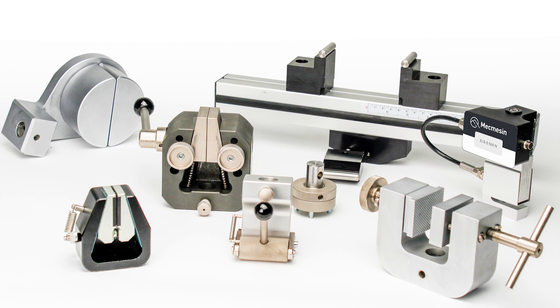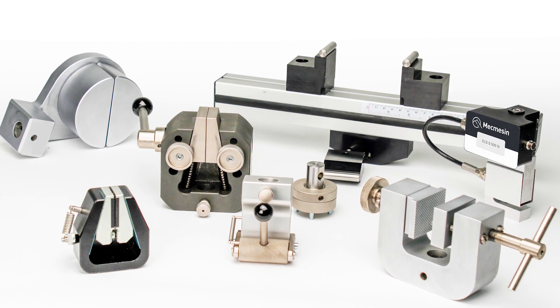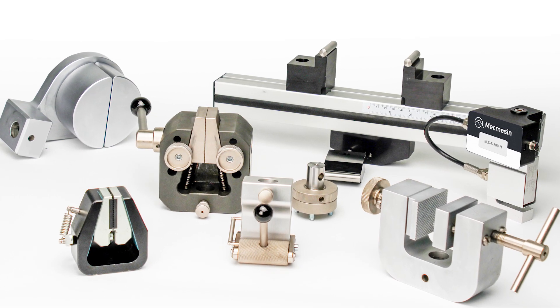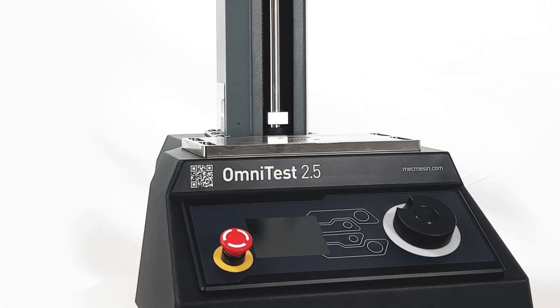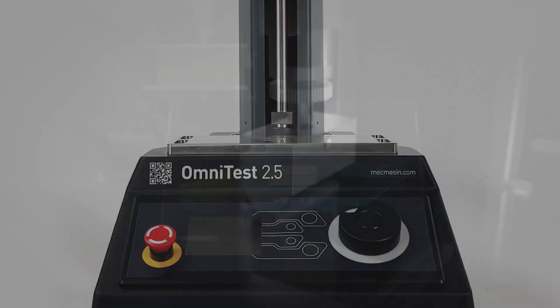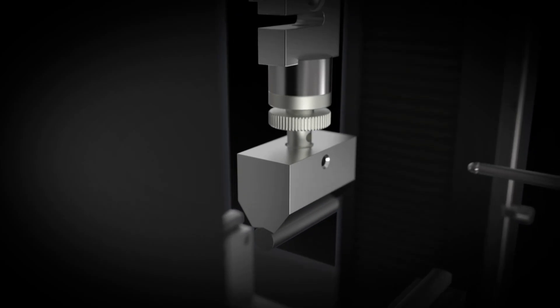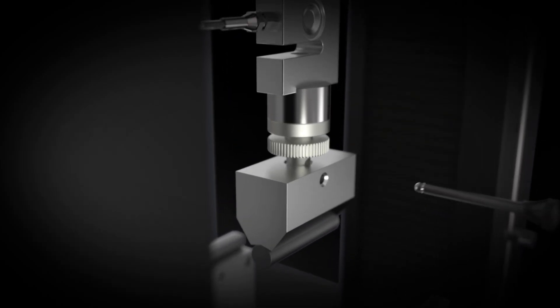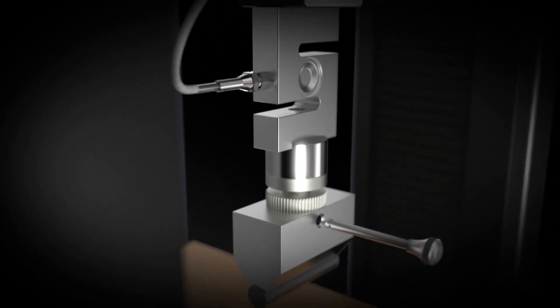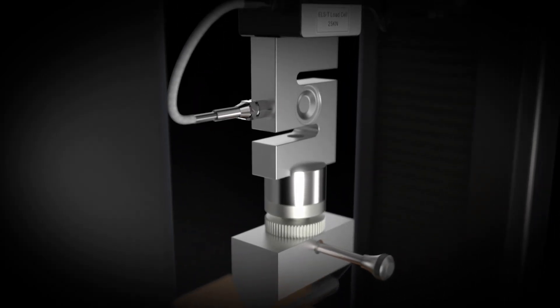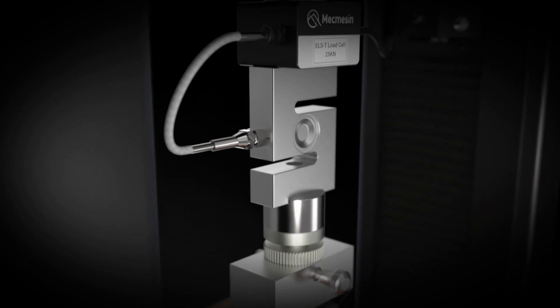An extensive range of tensile grips and compression jigs are available for all models of the Omni test. To save time when testing, grips can be easily connected to the Omni test with quick change adapters.